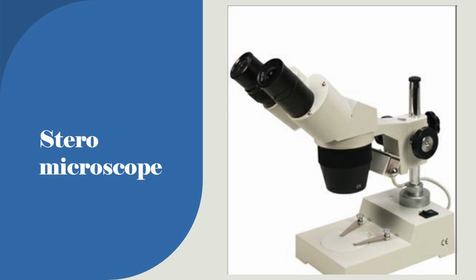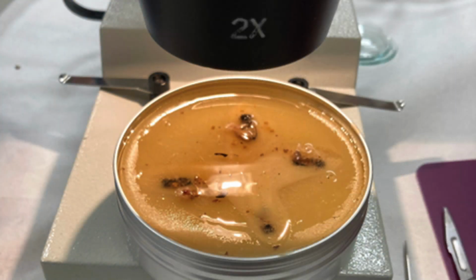So if we look at a stereo microscope, what we can do with it, the first thing, is dissect bees. Here I have a wax tray filled with wax, and you use a soldering iron and make a puddle and you drop the bee in. You submerge the bee with 50-50 alcohol, IPA and water, so it's completely submerged. Then you can cut the cuticle off, get into the bee, and investigate what's going on.